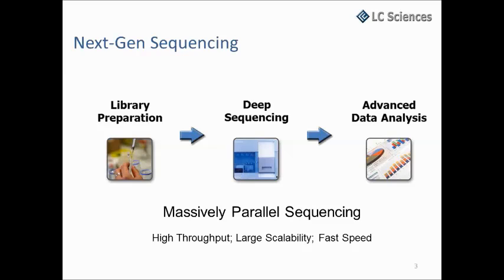We'll go through the next generation sequencing, give a brief introduction first. Then later we'll talk about the 16S rRNA gene sequencing, and then we will discuss a little about sample preparation and how to do the sample preservation and the DNA isolation. This will be given by Norwegian scientist Dr. Kim, and then we continue to the sequencing part, including data analysis. Then in the final part we will give some examples.